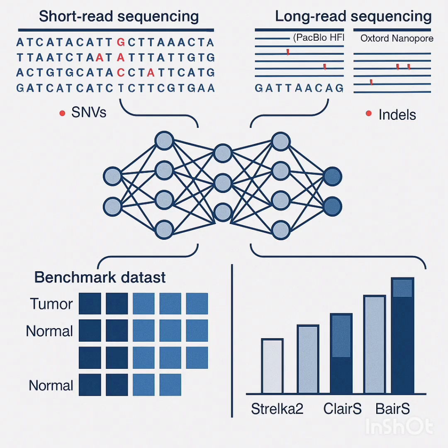It's a great question. It suggests that the model isn't just learning cancer mutations. It's learning to recognize and ignore the specific noise patterns and technical artifacts that come from different sequencing technologies, different sample preps, maybe even different underlying genomic backgrounds in the cell lines. So by seeing more diverse noise, it gets better at identifying the real signal across different contexts. Exactly. It learns robustness. It becomes less easily fooled by, say, a mapping glitch that looks like an indel but is really just a technical issue common in one type of data.